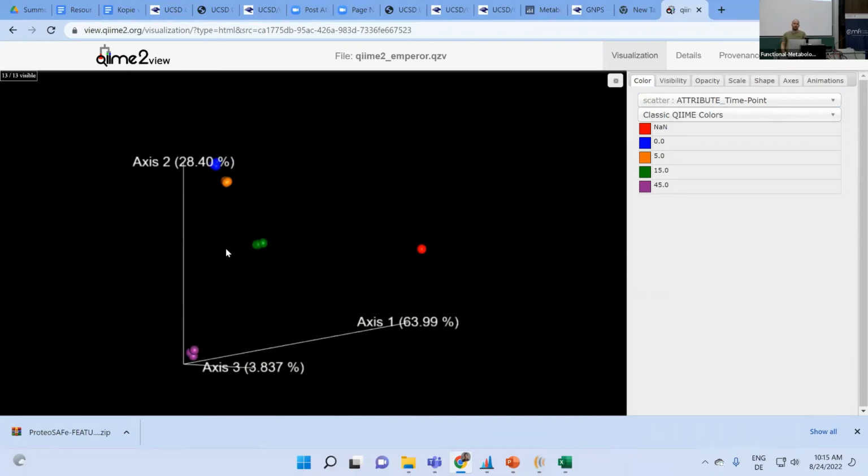So now, just as a general check, even though again, this is not final because the blank is still in there, it gives me confidence that what we observe here fits a little bit to my biological expectation, because I saw it in our dilution series, we would have that Synechococcus popping up, and then growing and taking over a little bit of the community, and then also the chemical space, right?